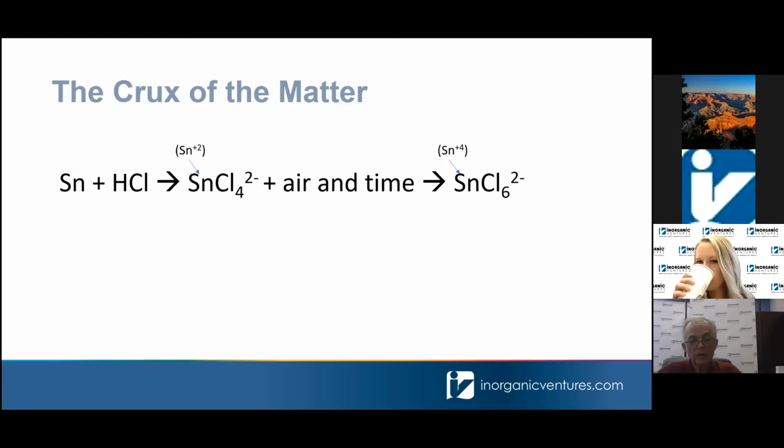We've been able to keep tin standards away from the air and keep tin stable for a long, long time, but you have to work in glove boxes, under conditions that are not convenient or comfortable. The HF is, we think, a simple solution to this problem.